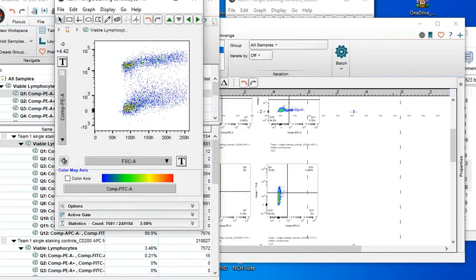Remember we said that the forward scatter will tell you the size. You know that the CD4 cells are usually bigger, while those from the myeloid wing, where you have your macrophages, are kind of granular. So now everything we have at the top here is your CD4 cells.